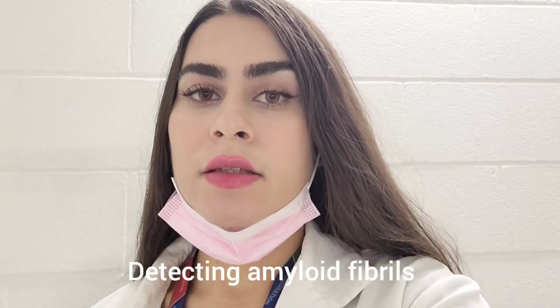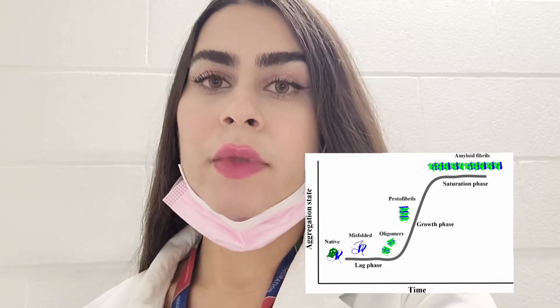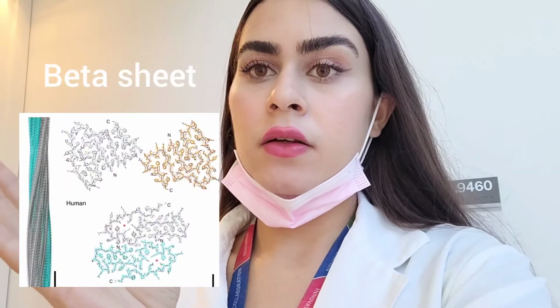Today I want to tell you guys about a technique called Thioflavin T Fluorescence Assay. This assay is used for detecting the formation of amyloid fibrils over time. When amyloid fibrils form, they're usually proteins going from an alpha helical conformation to a beta sheet conformation.